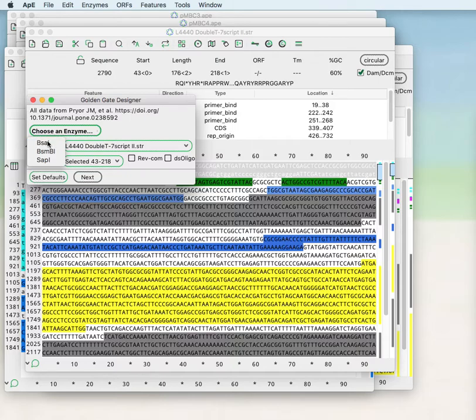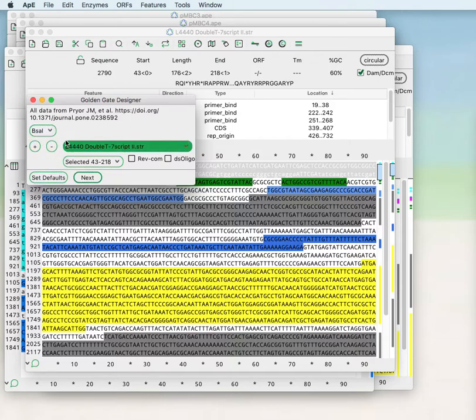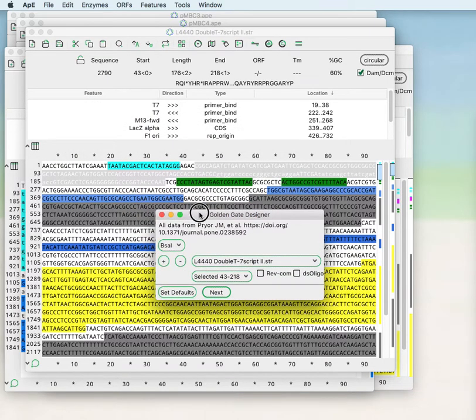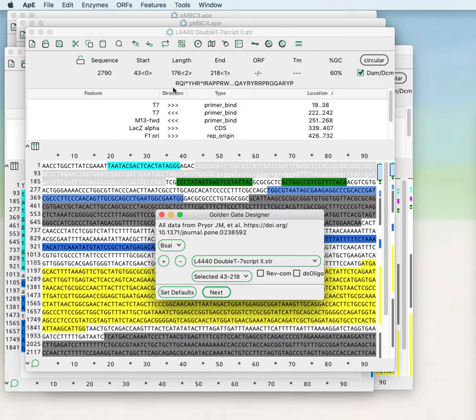If we choose BSA1 as our restriction enzyme that we'd like to use for our Golden Gate, then choose the L4440, the same plasmid that we used in the previous video for the ligation assembly tool.